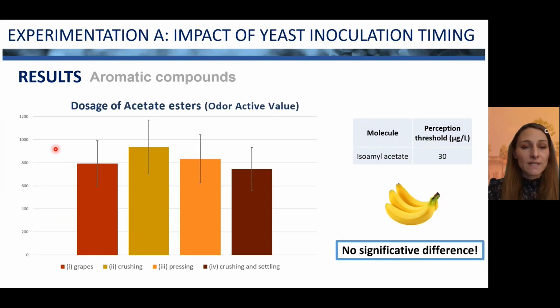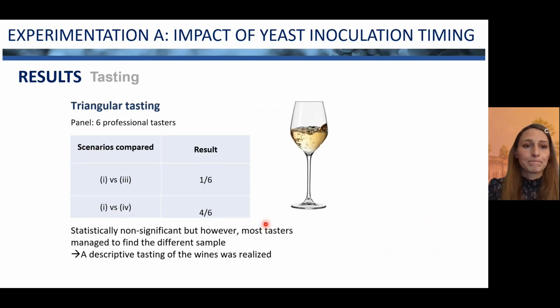Now, the dosage of the acetate esters, remember it's a key signature compound of this strain. We can again see differences, but no significant difference between the four scenarios for the acetate esters, and more specifically the isoamyl acetate.